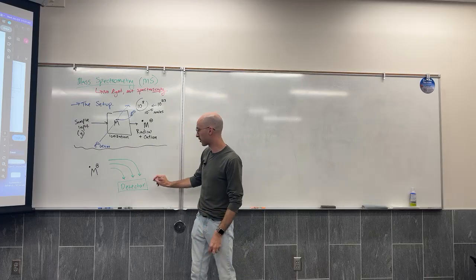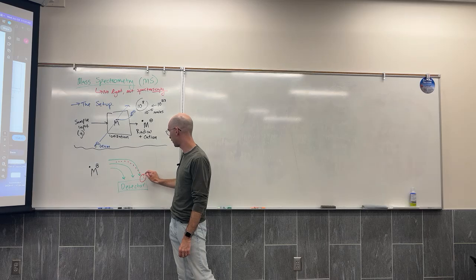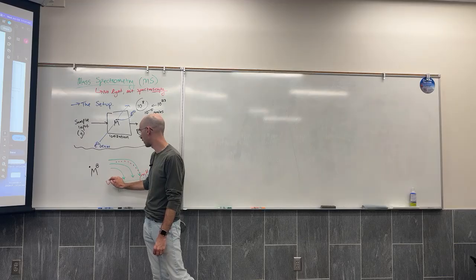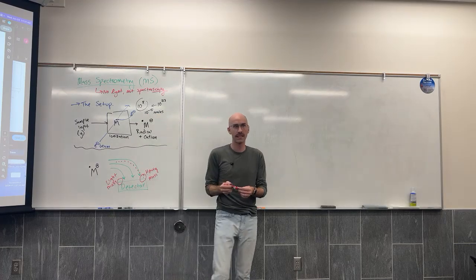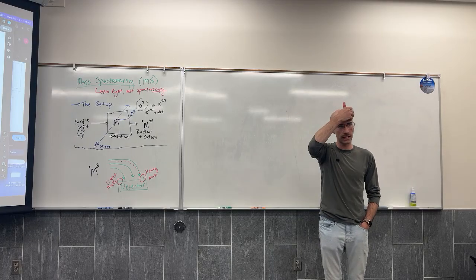So our detector, if it picks up a reading over here, then it knows that what hit it was heavy massed. And if it picks up a reading over here, it knows that what hit it was a light mass. And this is a lie that I find useful in understanding how it can differentiate heavy from light.